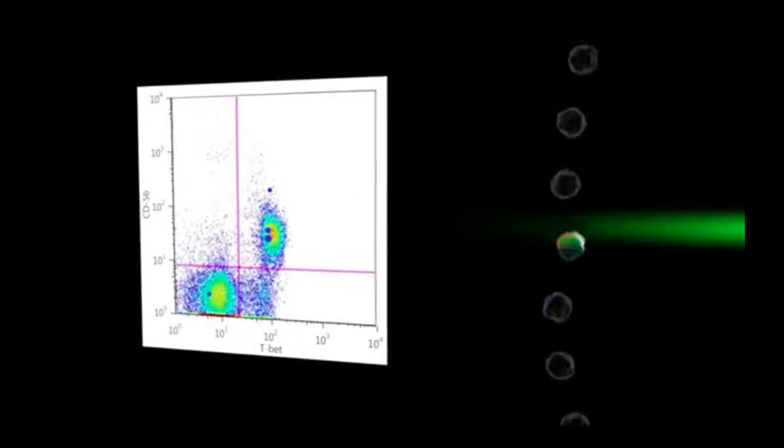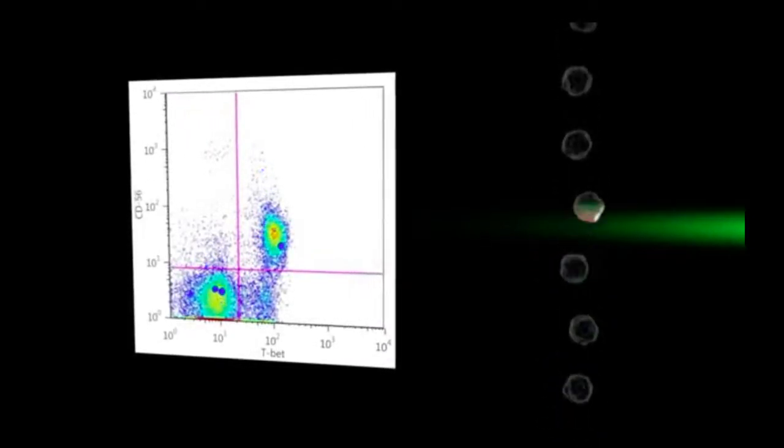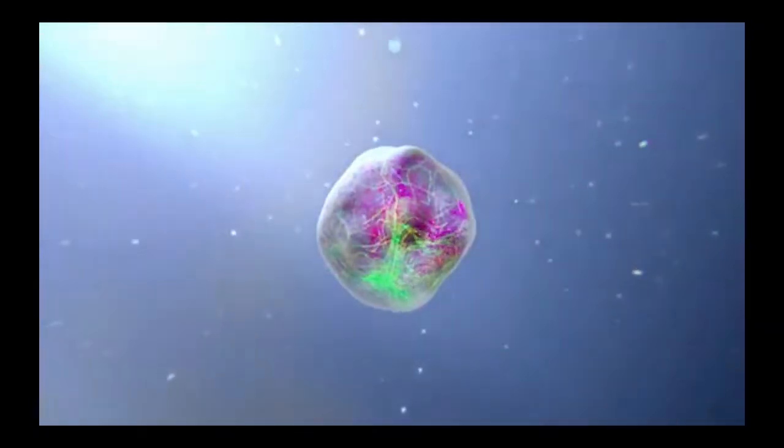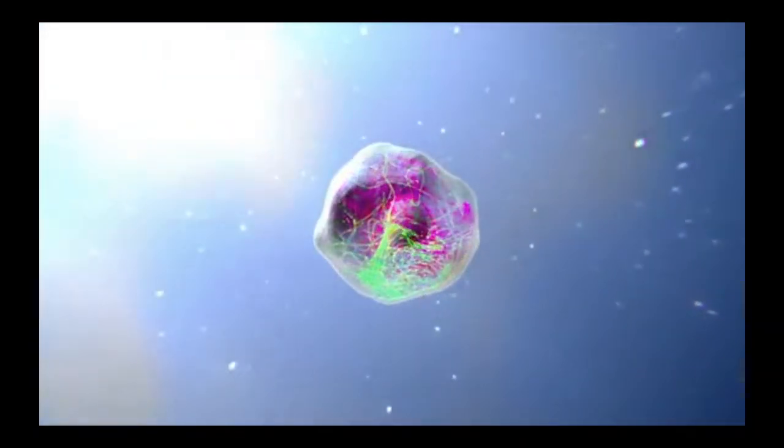Multiplex analysis of these protein targets saves time and resources while producing data-rich results, making intracellular flow cytometry an invaluable tool to unravel the complexities of cell signaling.